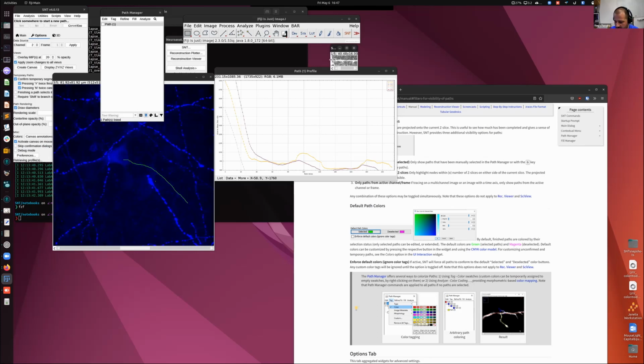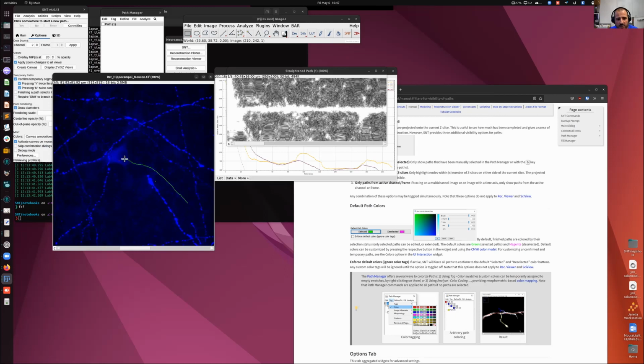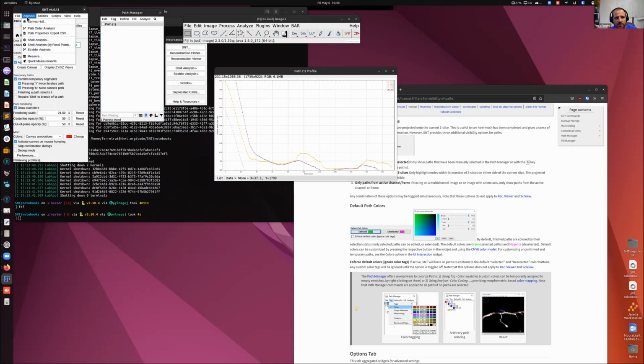And now what you have here is the image. So it's basically the linearized pixels around this path, and this works in 3D, and it also works across the multi-channels, which can be useful. Okay, so in a nutshell, that's pretty much it. Okay, things that you can do.